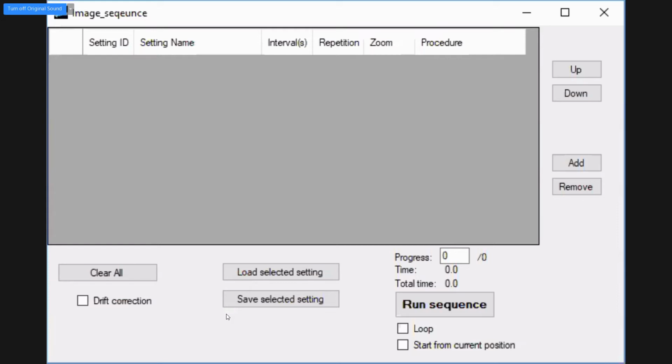Okay. This is a feature that allows you to change imaging parameters in the middle of an experiment automatically. So let's say I wanted to take these stacks, and then I wanted to do some really fast imaging just in one lane, and then I wanted to do really slow imaging for like 3 hours with this stack again.